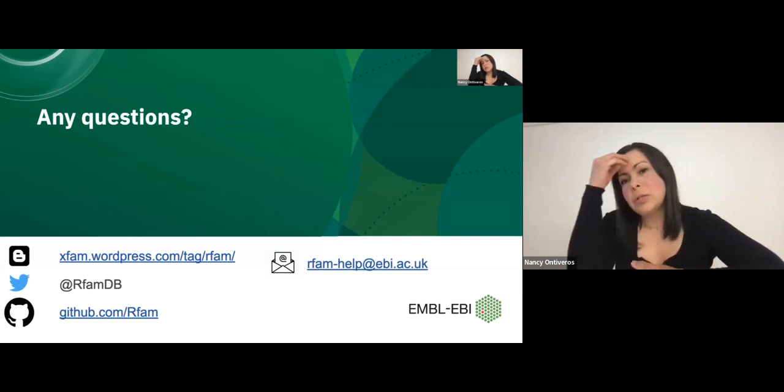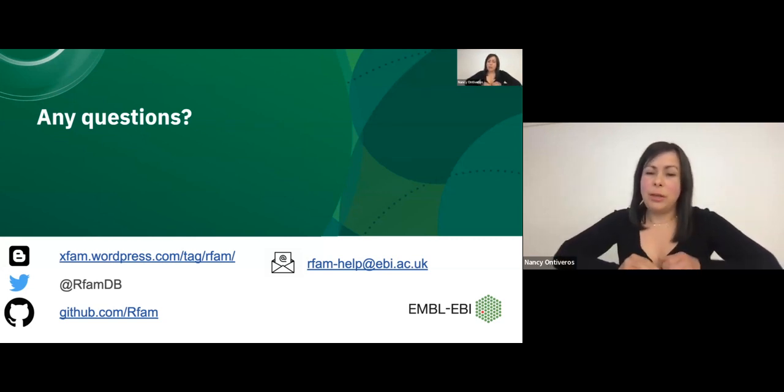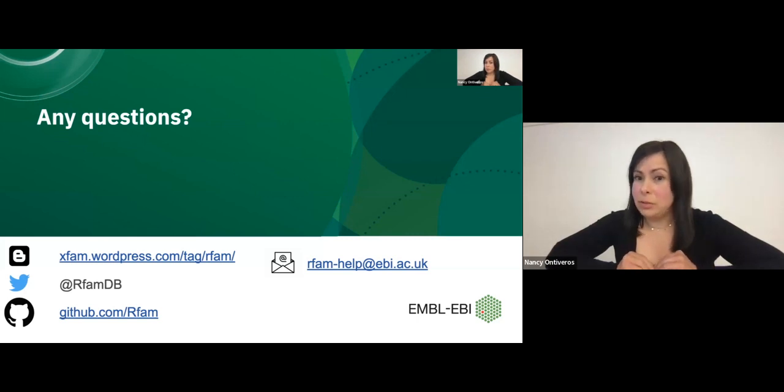Yeah, I can go a little bit. I think there is not a region that is best represented for non-coding RNA families. Maybe you are talking about riboswitches, because this happens in bacteria, and bacteria have a lot of regulation in cis. That means 5' regions are going to be easy places to find non-coding RNA regions, but not necessarily in eukaryotes, or in viruses. So I think we really haven't made that analysis yet for the Rfam families to know which regions are more represented than others.